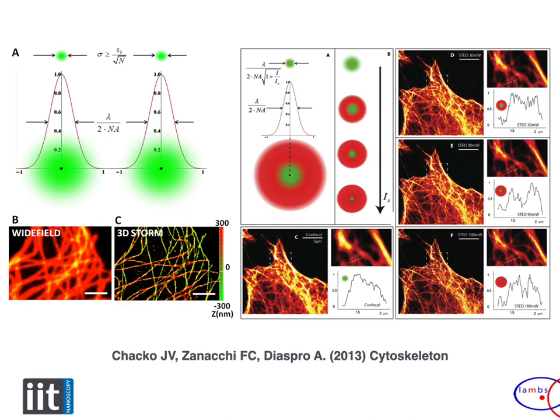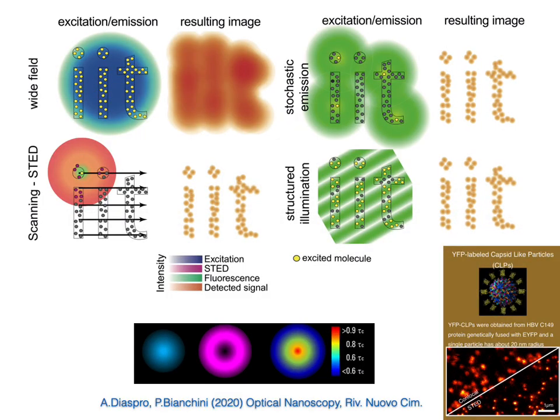The other is the one related to the interrogation idea provided by Stefan Hell. Simply using a second beam of a certain strength, or you could say power of the beam, for shrinking the information you are reporting to your detector. When you play this game of shrinking or of single molecules, including structured illumination provided by Mats Gustafsson, that was not part of the Nobel Prize simply because, unfortunately, he passed away before, and very young.